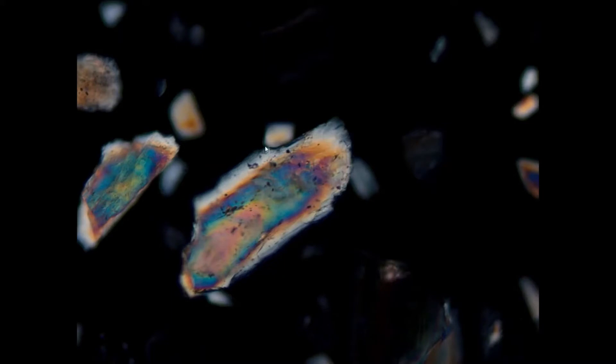On the rim where it's thinner, we see first-order colors and in the center, where it's a little bit thicker, we can see second-order interference colors.